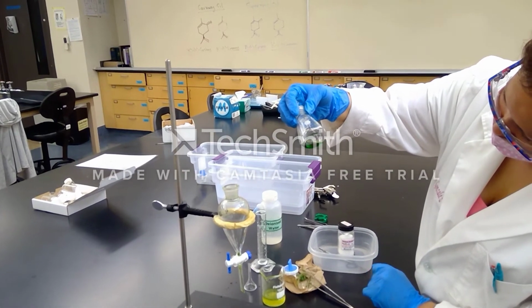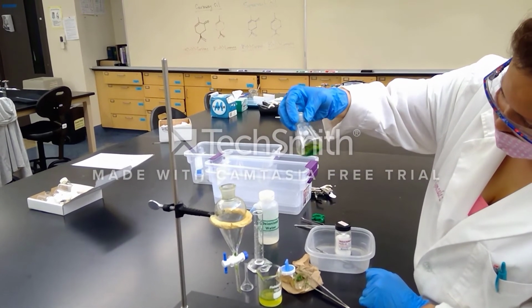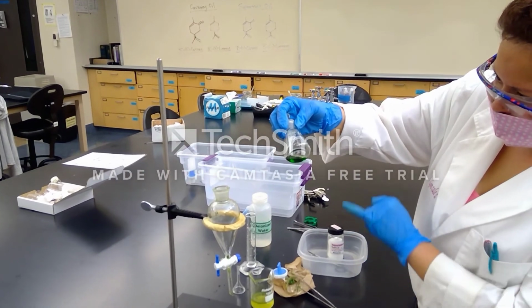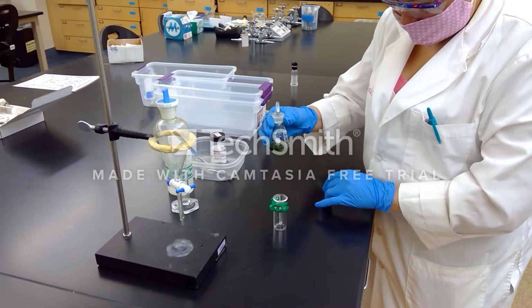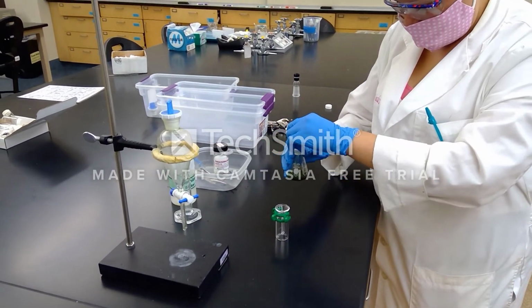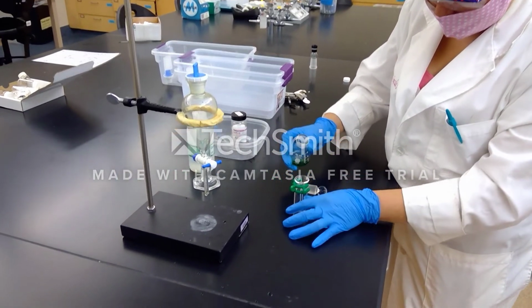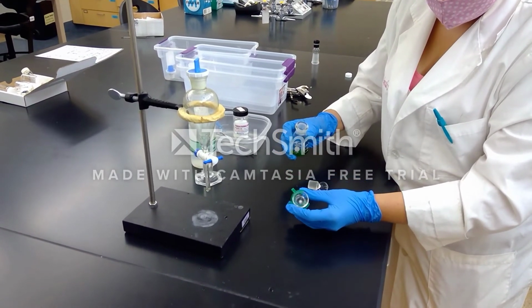So we're going to let this sit for a little bit so that the sodium sulfate can do its job. Once we complete the drying process here, we're going to filter out that salt and take this to the rotavap to evaporate out the liquid. Okay, so we are going to go ahead and filter our extract here from the spinach into a scintillation vial. And this scintillation vial will be able to fit onto our adapter that goes eventually to the rotavap. I have a small piece of cotton. I'm just going to angle this towards you in my funnel here.